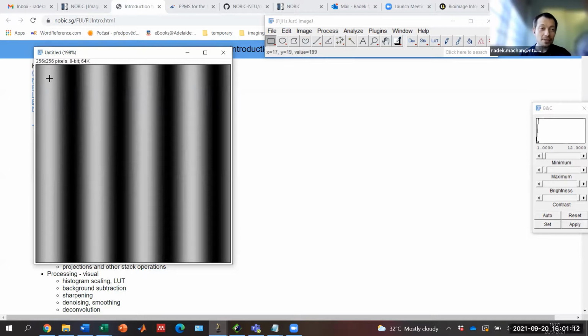So in this case, instead of saying that we have a light stripe here, a dark stripe here, a light stripe here, a dark stripe here, we can say that we have stripes which are vertical and they have a certain frequency. And that's an equivalent description of this image. It is quite natural, or at least reasonably natural, for an image of a periodic structure like this one, because it's quite logical that we might describe it using spatial frequencies. That's why I'm showing this image here.